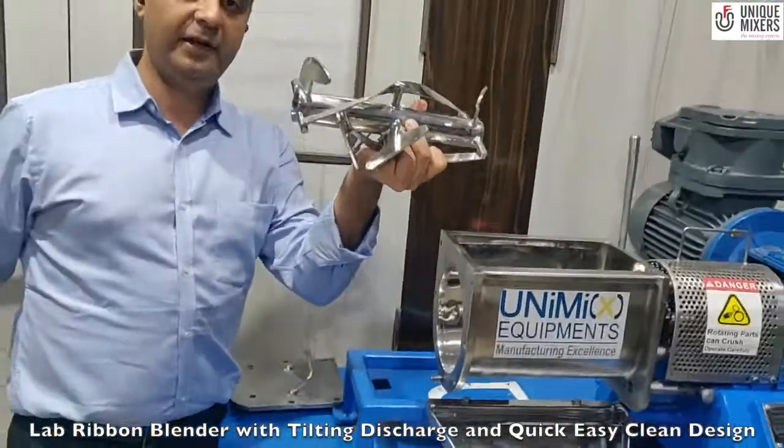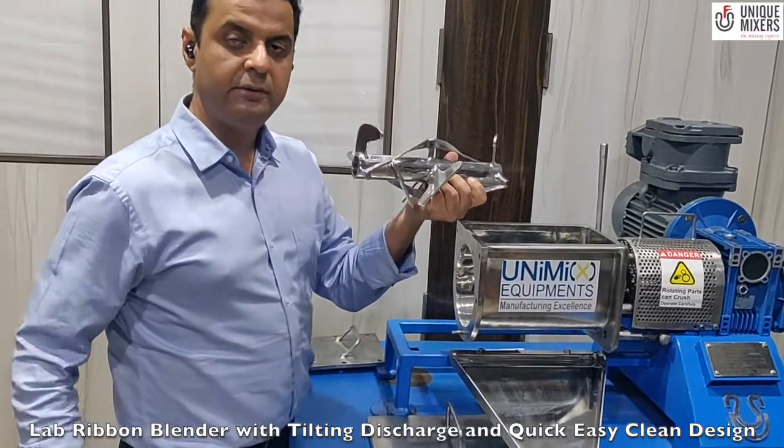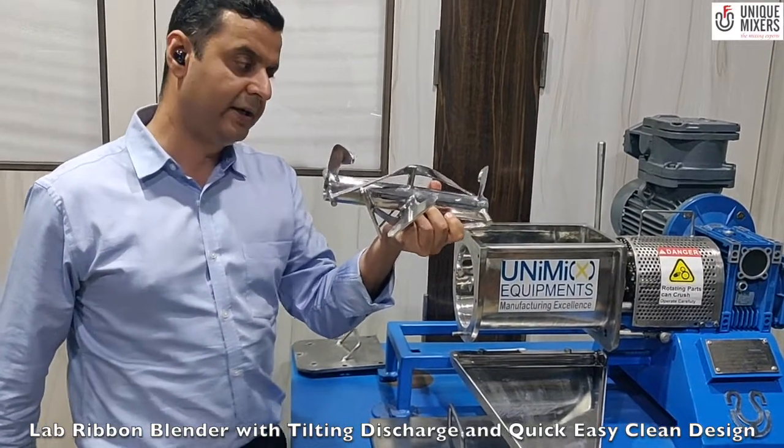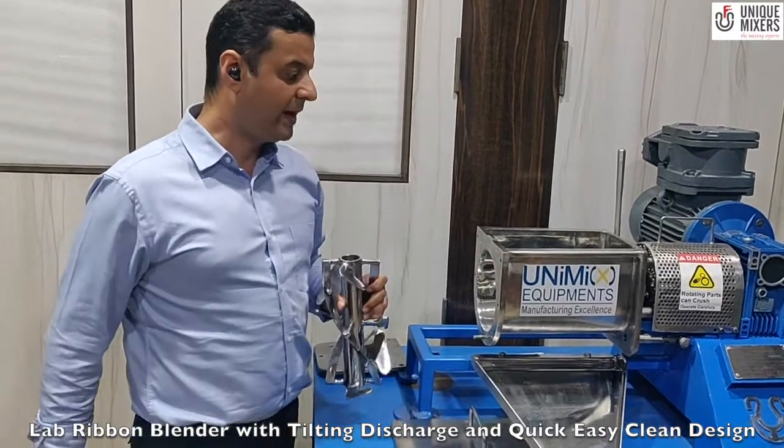We have another design — the ribbon paddle design. This was the double helical ribbon. In case you want to have a different kind of agitation profile or a different application, all you do is plug this in and run back your machine.